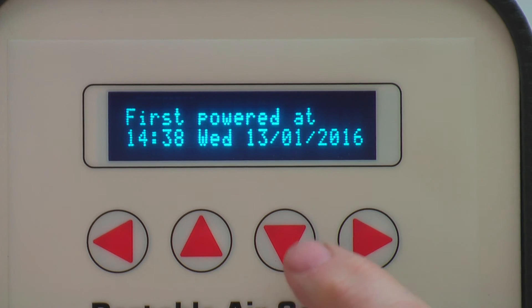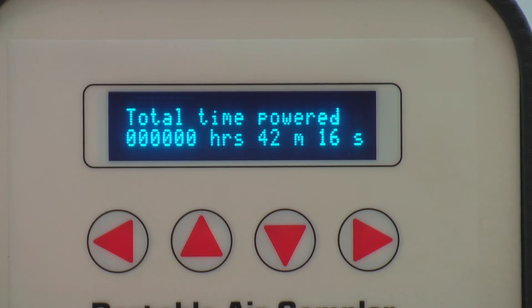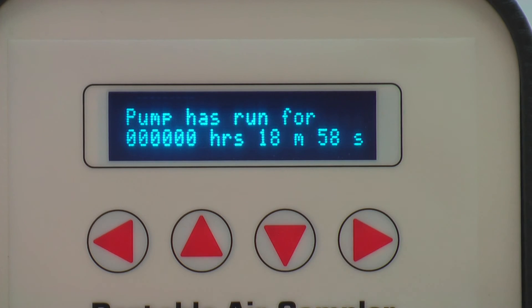You can see a range of important operating information if you press the down arrow repeatedly. These include total time powered, pump run time, and last calibration date.